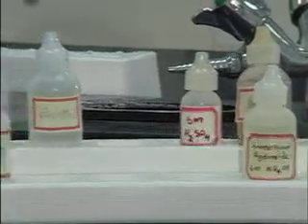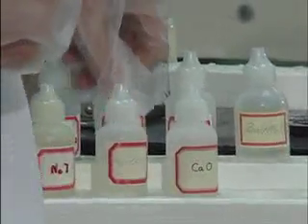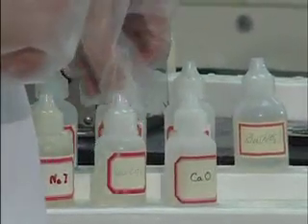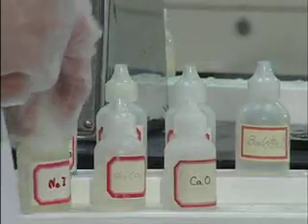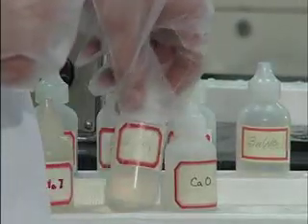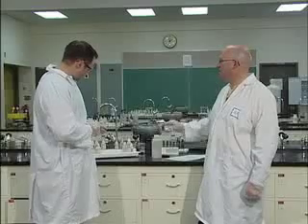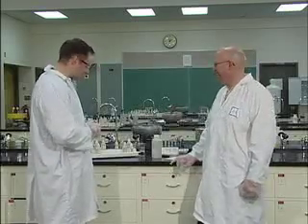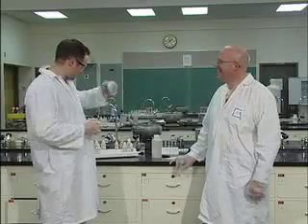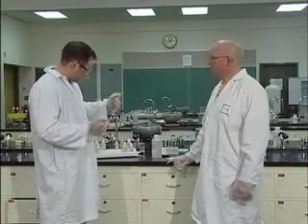In your rack, you'll notice you have a lot of nitrates. So you have copper nitrate, lead nitrate, aluminum nitrate, barium nitrate, sodium nitrate, sodium iodide, sodium carbonate, calcium oxide. All of these are basically salts dissolved in solution. Don't you wish they had a Scott nitrate? They do. I'm just kidding. But you'll notice nitrates are poisonous. Please be careful with them. Don't drink them. They could be dangerous.